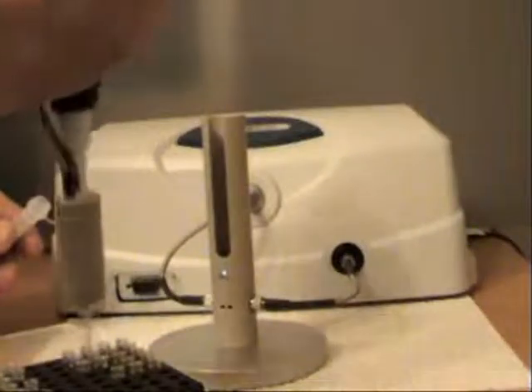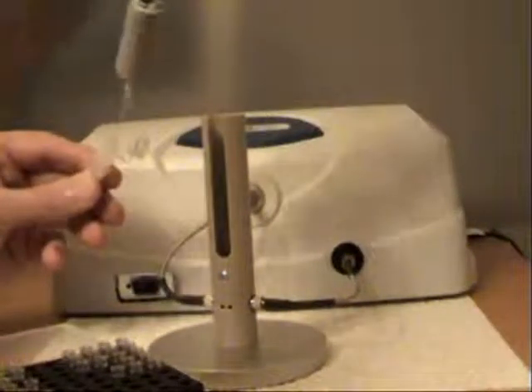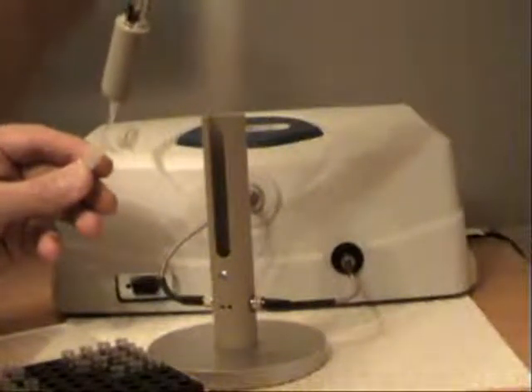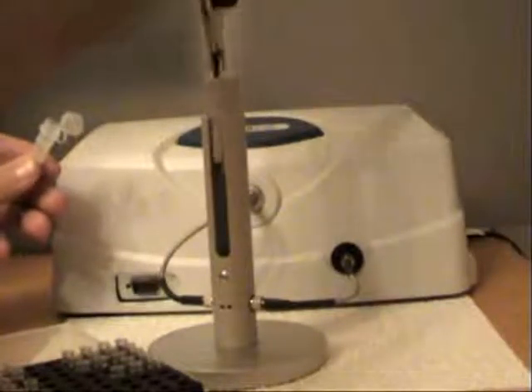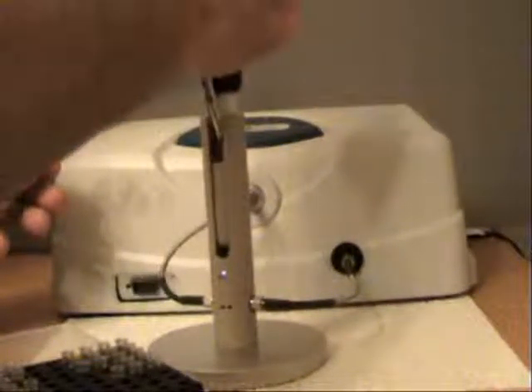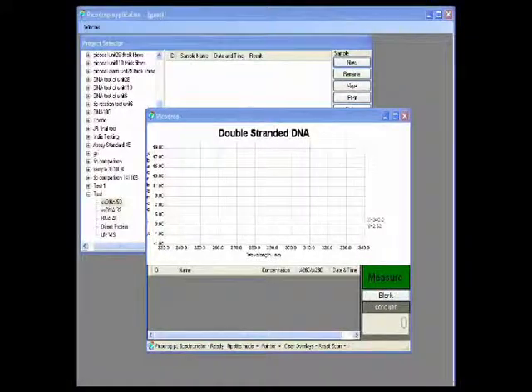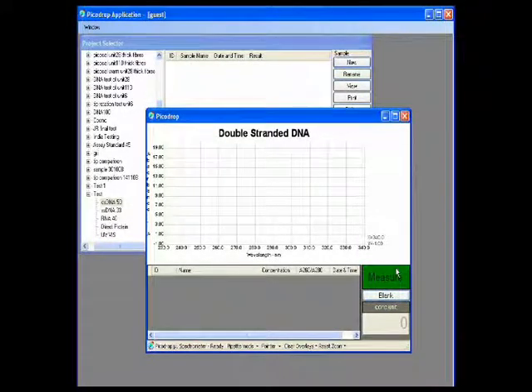To start measuring your sample, simply take a tip, pipette 2.5 microlitres of your sample and place into the holder. Then simply press measure.